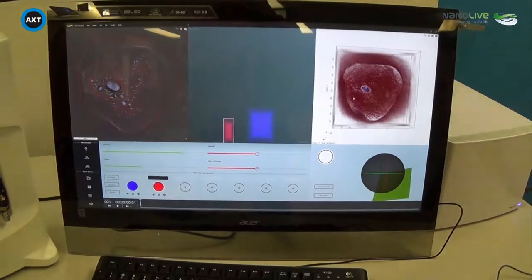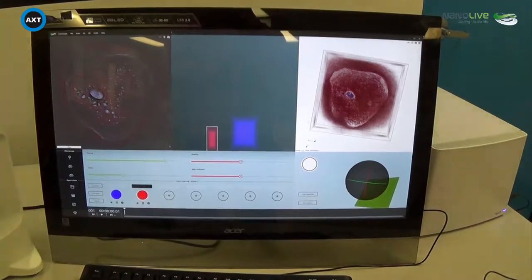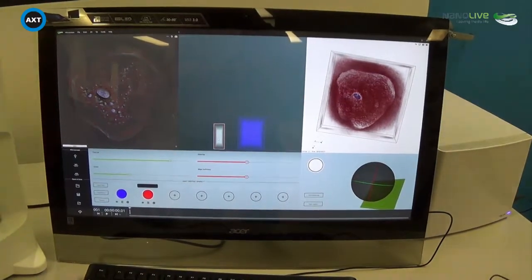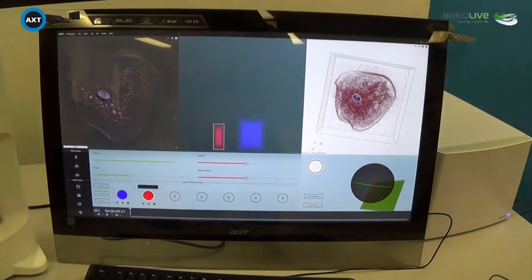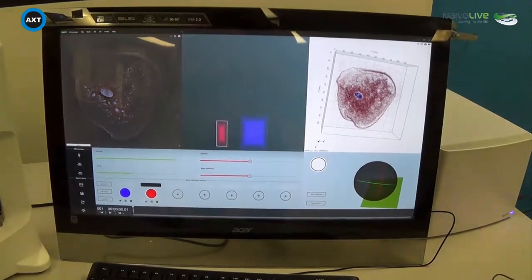I'm able to actually see that I've colored in way more than I should have. So actually I've colored outside of the membrane, and so I can fix that by just adjusting this box here in the center. So now you can see that we've been able to stain the cell much more clearly.